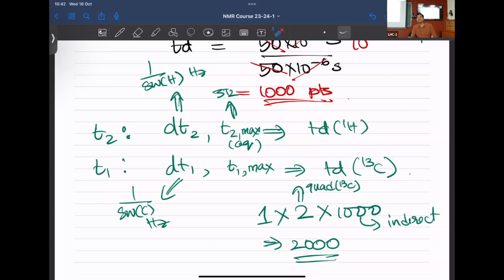And if you have to increase it by another 8, let's say 8 scans have to be acquired, it immediately goes to 4 hours. If you have to run something like 128 scans, it goes to overnight. All that depends upon the concentration, labeling, and everything that you're working with. Yeah. So that's why 2D NMR, although super helpful, comes at a cost. Everything that you gain comes at a cost of something else. It's always a compromise. Good question, Nikhil. I hope I've been able to answer your question in this regard.